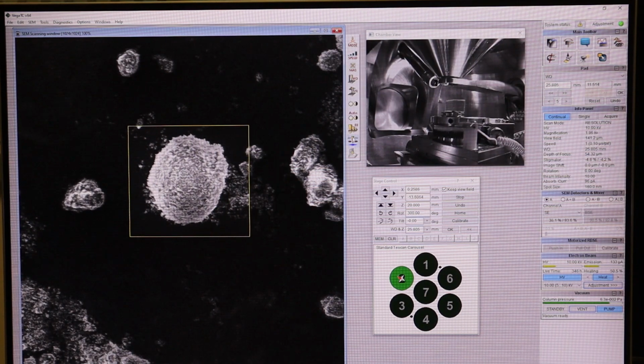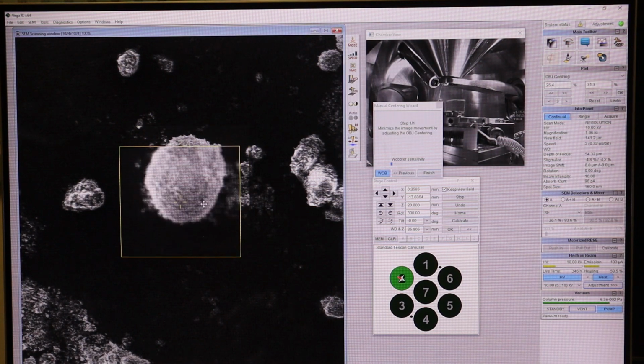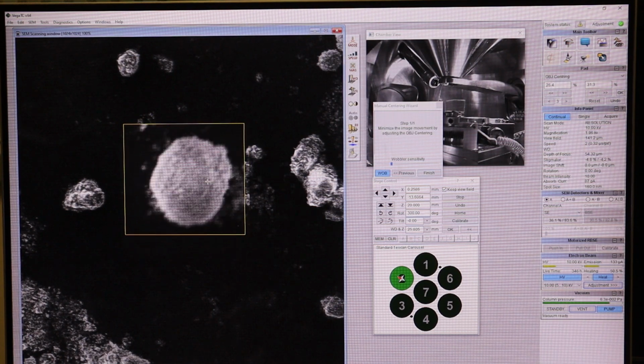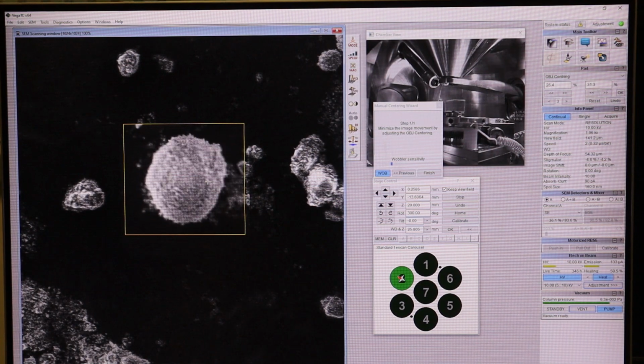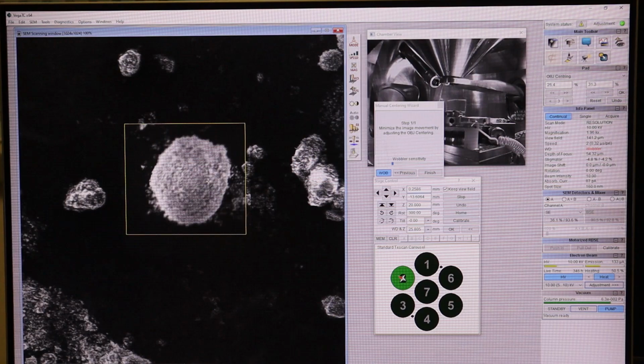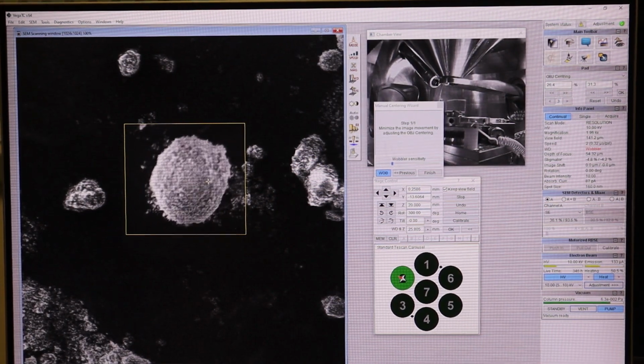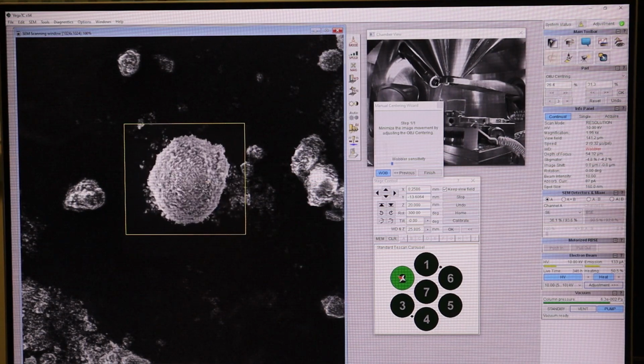We then will go to the wobbler, right, this button here, hit next, and then like the stigmators, you will move the trackball to try to reduce this vibration and improve image quality. So right now it's shaking left and right, so that means you move the trackball either left or right to fix this. I'm going to go to the left.